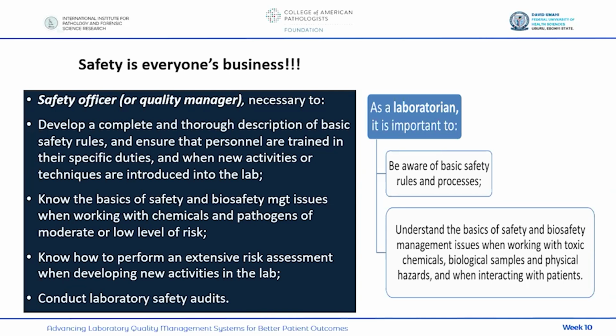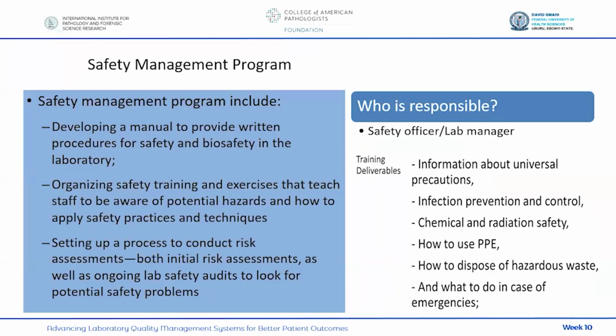The maxim is safety first. You must put everyone's safety first before any other thing, okay? So based on all those essentials, we have said the safety officer or the quality manager is expected to develop a safety manual. So that manual is provided to guide laboratory staff when it comes to safety. And so it should provide written procedures for safety and biosafety.